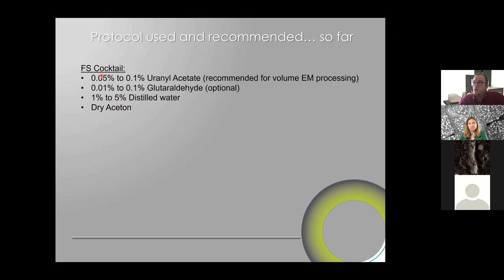I noticed that the glutaraldehyde somehow increases the contrast to some extent. I don't know exactly why. I have the feeling that the glutaraldehyde tends to squish a bit the membrane. So basically they become denser, and that's what gives me some contrast. I'm not sure if this is just an interpretation or if this is reality. I'm not a chemist, again, but somehow glutaraldehyde increases the contrast at the membranes.